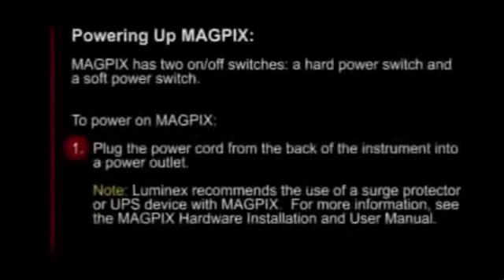Powering up MagPix. MagPix has two on-off switches: a hard power switch and a soft power switch. To power on MagPix, plug the power cord from the back of the instrument into a power outlet.